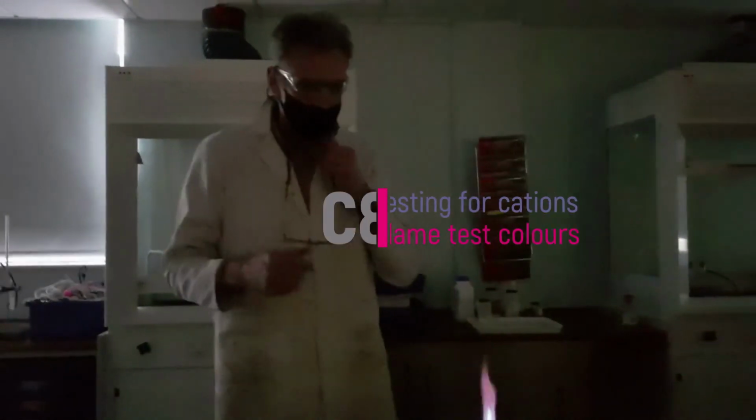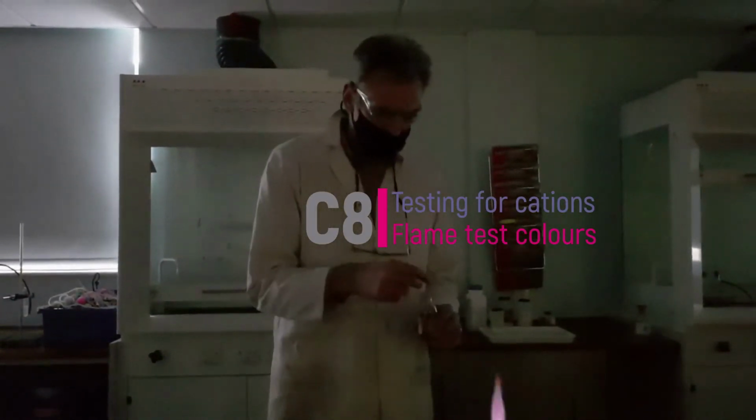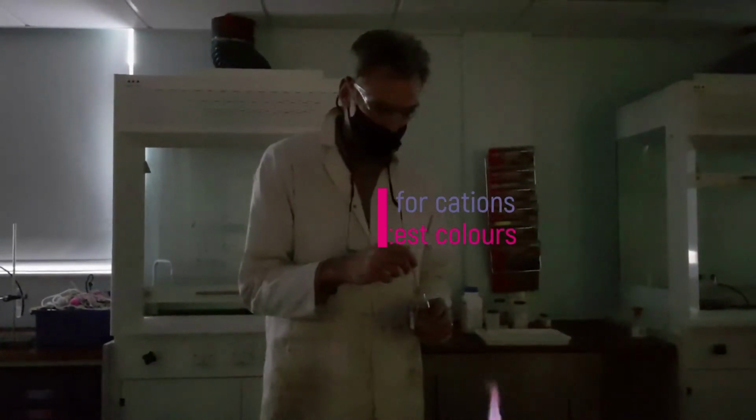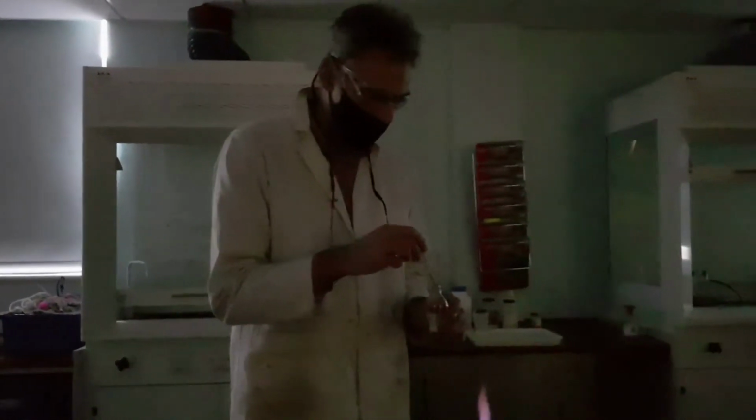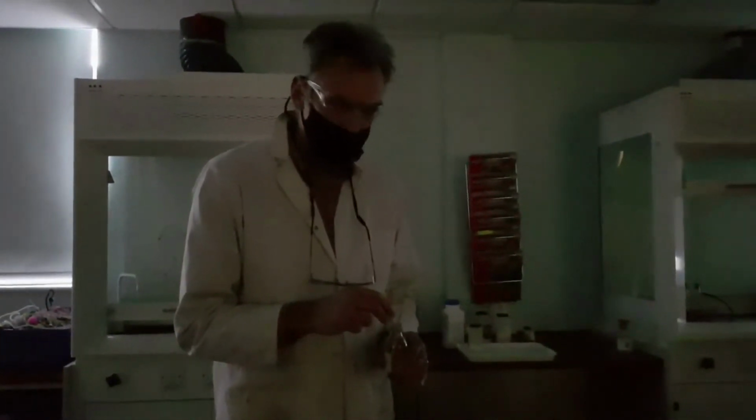So here we are in the dark. A nice lesson just before Christmas. For those of you that had this, for those that didn't, well, hopefully this will make up for it. What we're doing here is we are testing for cations. That is the positive metal ions.